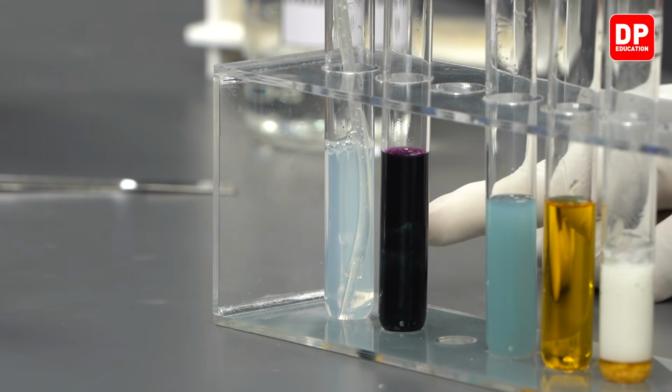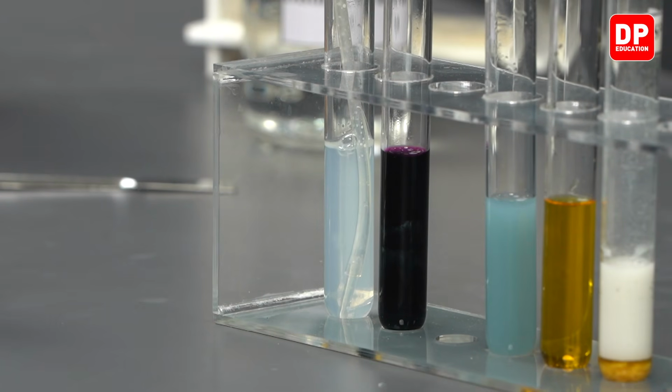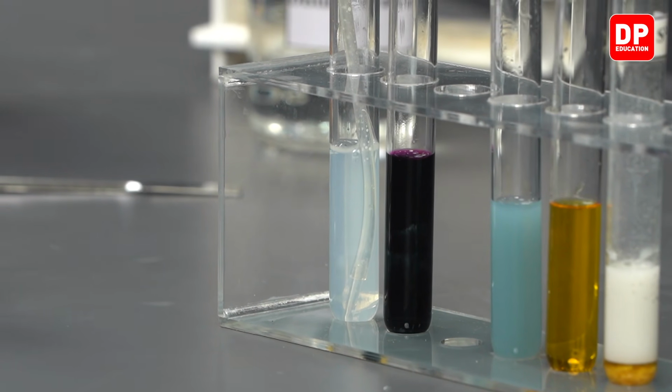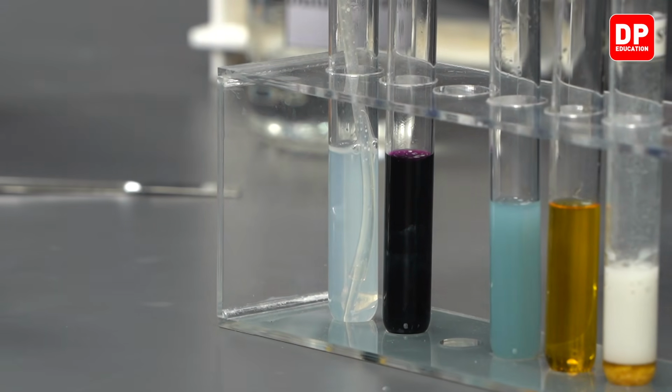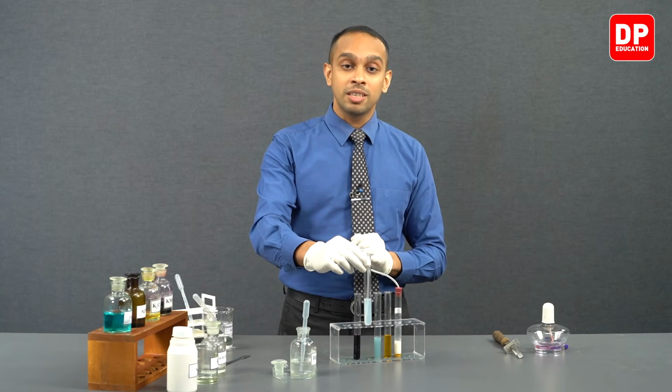Now students, we can very clearly see that the color of acidified potassium permanganate solution completely disappeared, and now we have formed a milky solution.